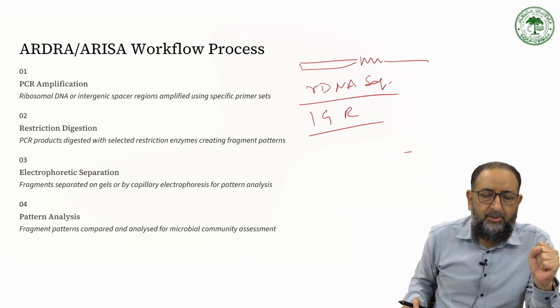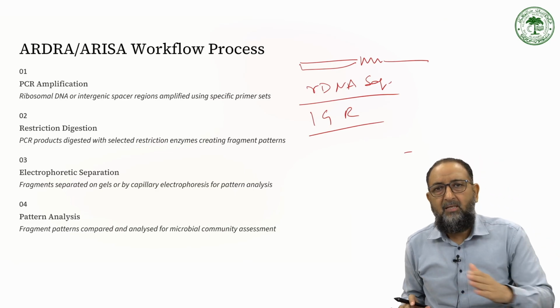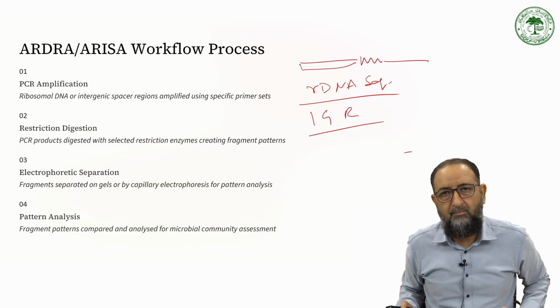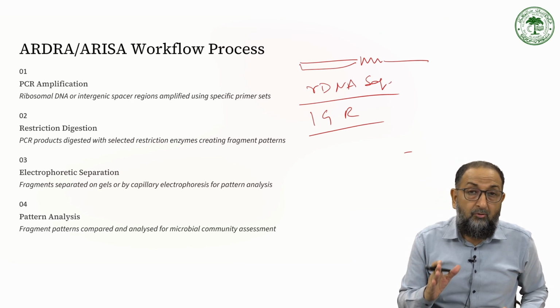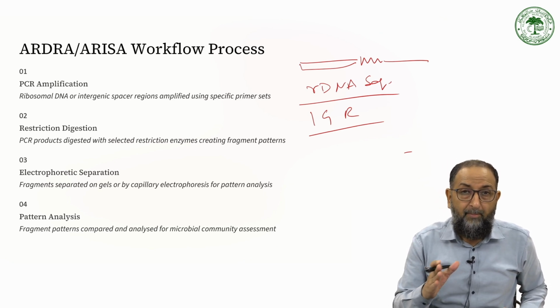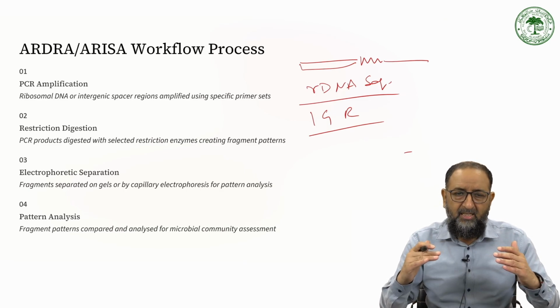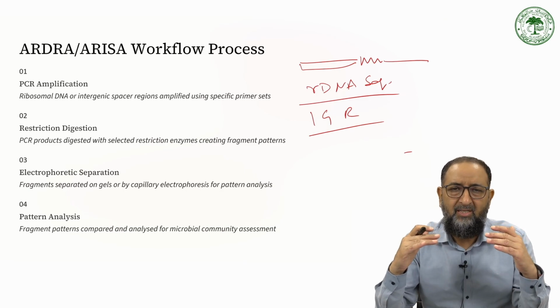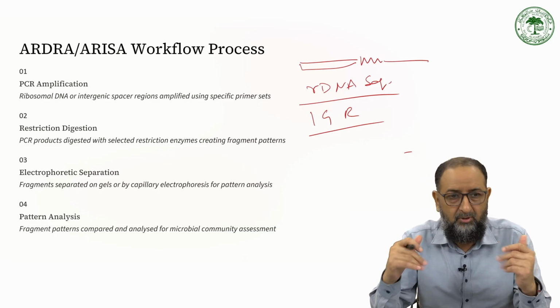Now, you can ask a question: a single restriction enzyme is used for digestion, does it give you different patterns? Yes, this is the beauty of this technique. If you are not using a single restriction enzyme, you will mess up the whole experiment. You cannot find a variation between these two, and you cannot rule out the possibility of whether they belong to the same or to different ones.